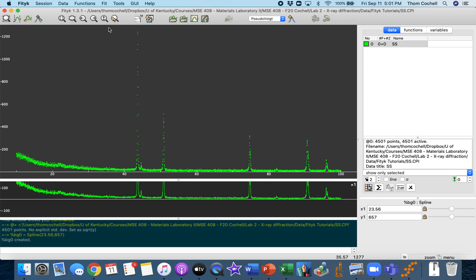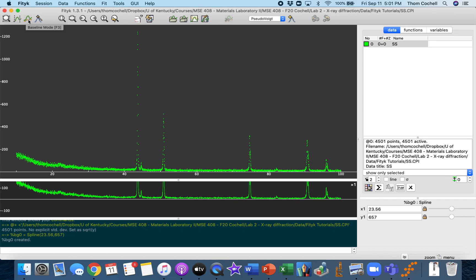This FIDIC program does a pretty good job and is easy to navigate. We're still in this normal mode which allows you to zoom. What we want to do is switch to baseline mode, which is F3. This allows us to establish what the baseline is.